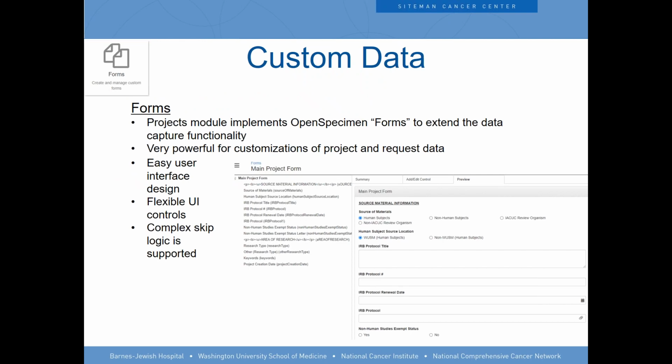It's a one-time creation, and it's associated to a PI, any collaborators that are requesting services against specimens, and it has the laboratory that you're actually requesting services from. In our case, that's 100% always the tissue procurement core, what we call our TPC. But for other institutions, it could very well be different laboratories performing different services. But like I said, in our case, it's always the one.